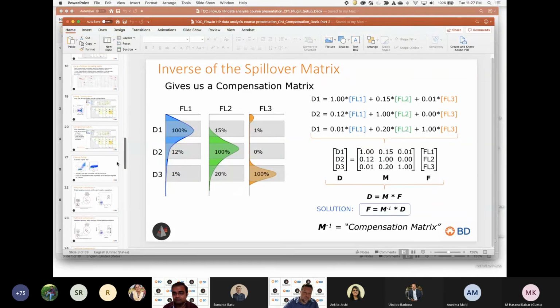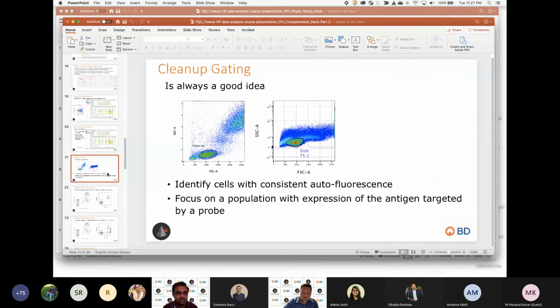Please go for the answer. So we are getting answers. Most people say it's D, all of the above are correct. Yeah, we're seeing that as the response. Some options are coming also, like C and B. Okay. 90% say option D is correct, and that is the right answer.